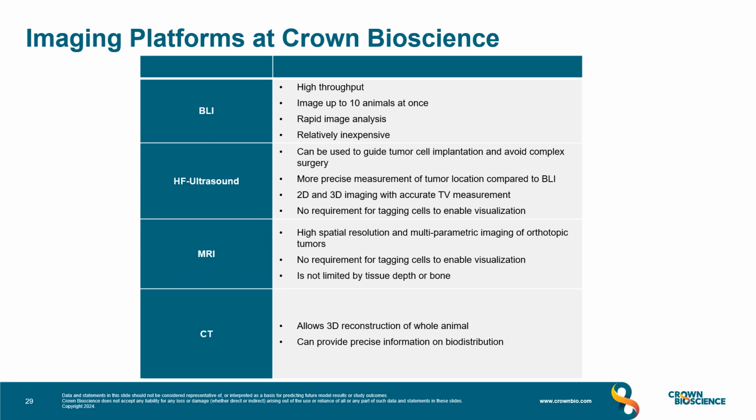High-frequency ultrasound can be used to guide tumor cell implantation and avoid complex surgery. It can give more precise measurement of tumor location compared to BLI. It allows 2D and 3D imaging with accurate tumor volume measurement. And there's no requirement for tagging your cells to enable visualization.